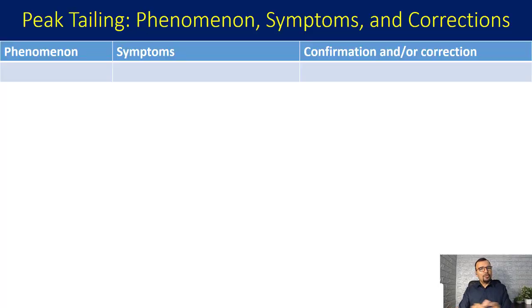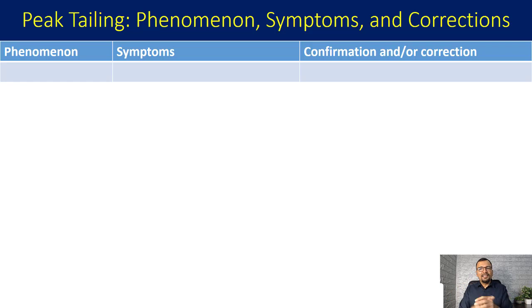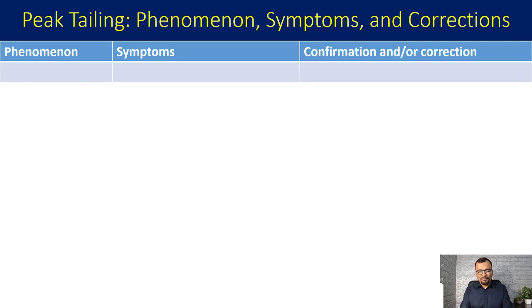This is the structure for today's discussion. We will talk about the underlying phenomenon, the respective symptoms, and then the confirmation and likely corrections. The first phenomenon we will discuss is the wrong combination of sample and your column packing.